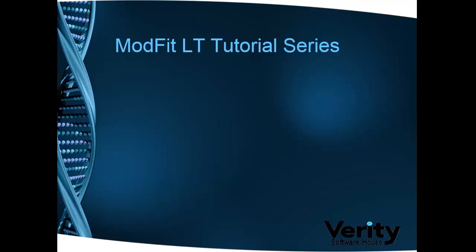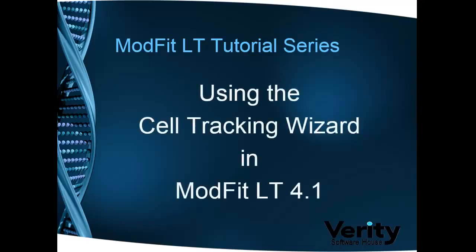In this tutorial, you'll see how to start the cell tracking wizard, how to adjust the settings used to create the model, and how to analyze your data samples with the model created. The goal is to identify the location of the parent population and then confirm a few other settings. Once these simple decisions are made, the wizard constructs a model that accurately analyzes your cell tracking samples. Let's get working.